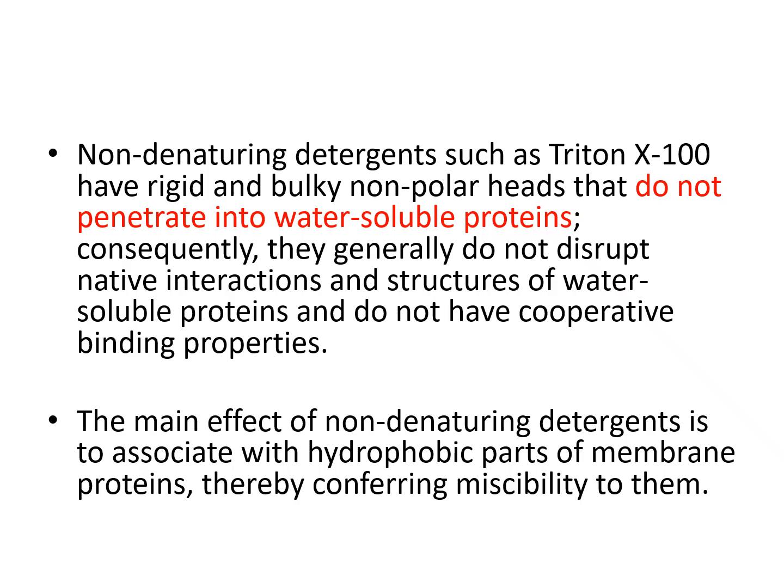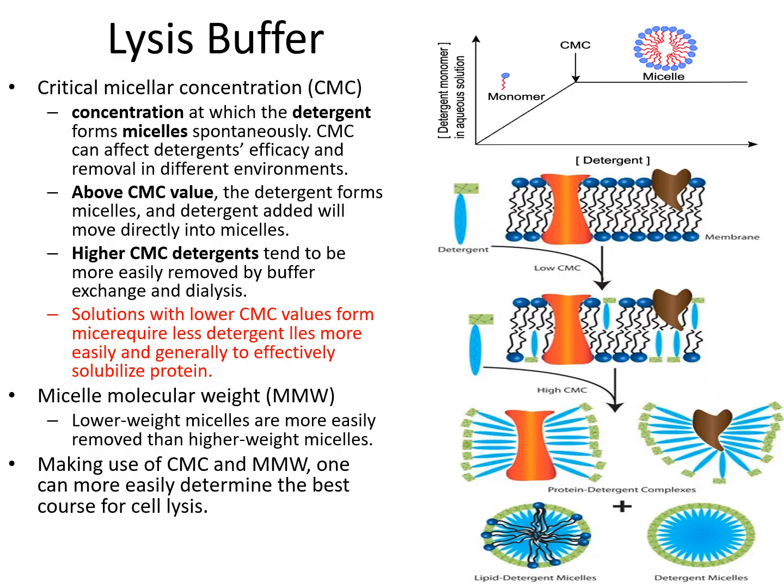And non-denaturing detergents like Triton X-100 have a rigid and bulky non-polar head and do not penetrate into water-soluble proteins. Consequently, they generally do not disrupt native interactions and structure of water-soluble proteins and do not have cooperative binding properties. The effect of the non-denaturing detergent is to associate with the hydrophobic part of membrane protein, therefore conferring miscibility to them.